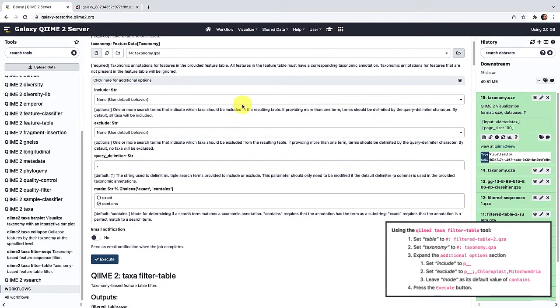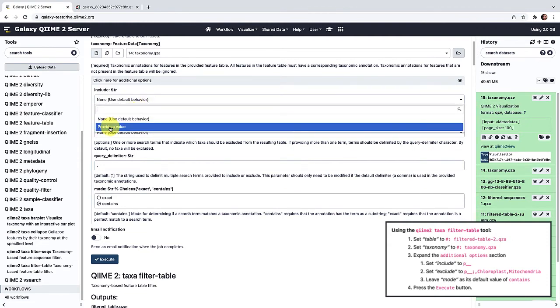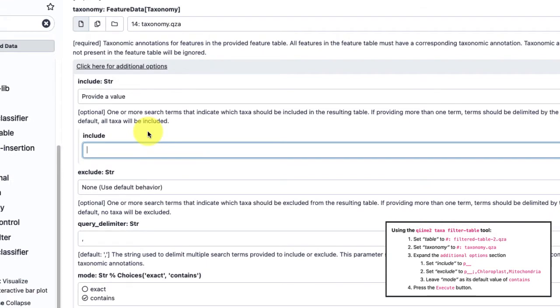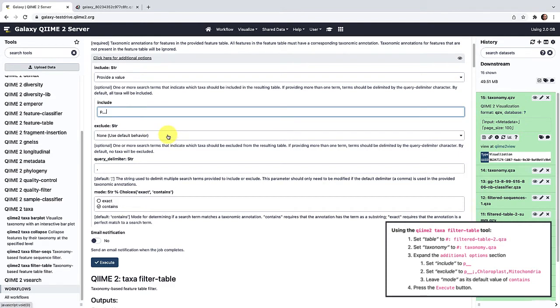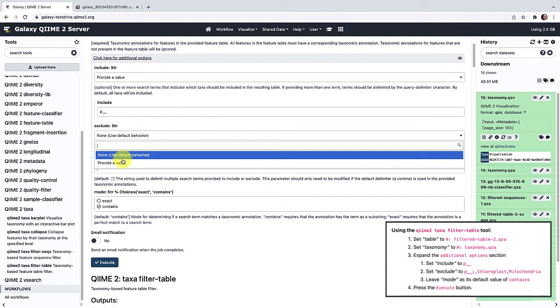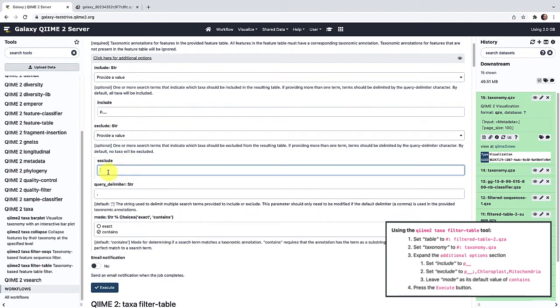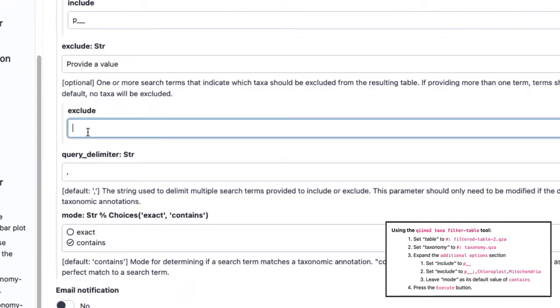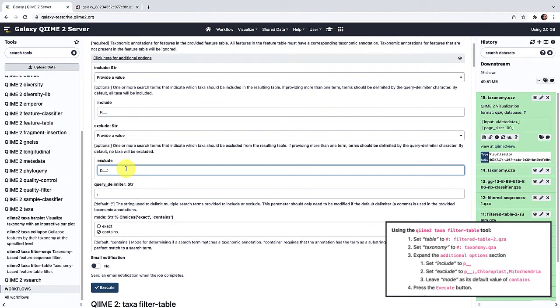Now that we have our data and taxonomy selected, we can select our filtering parameters by clicking 'click here for additional options.' For our first criteria, we want to make sure there has been a phylum level designation assigned. So we'll click in the include section and change the dropdown from none to provide a value. In the GreenGenes taxonomy nomenclature, the phylum level taxa designation is indicated by 'p__'. Next, we'll move on to the characteristics we'd like to exclude. We'll come to the exclude section and change the dropdown to provide a value. First, we'll want to exclude any phylum level taxa that have not been assigned a name, indicated by 'p__;' — that is the phylum level designation followed by a semicolon.